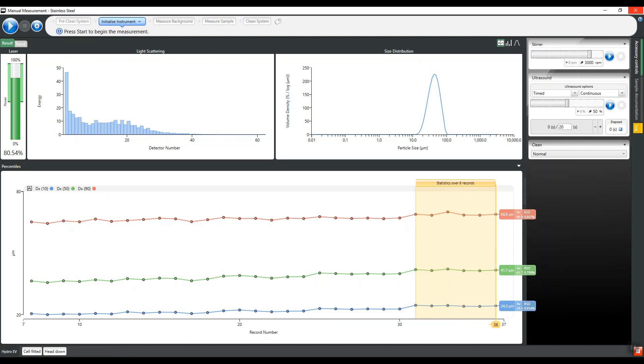With this metal powder, measurements were carried out at increasing stir speeds, which is useful for establishing when complete dispersion of the material is achieved.